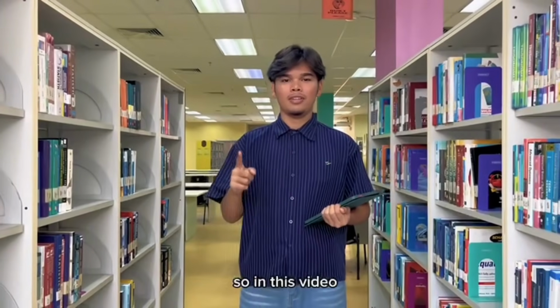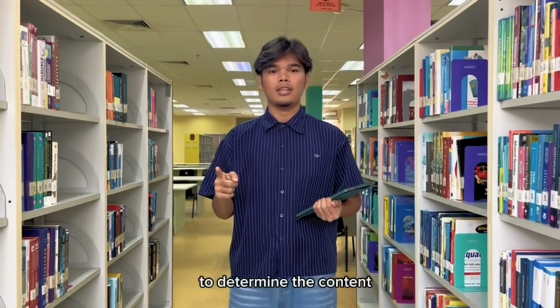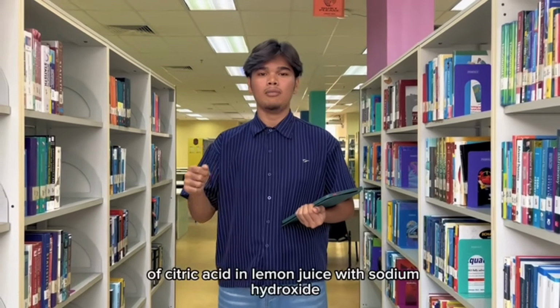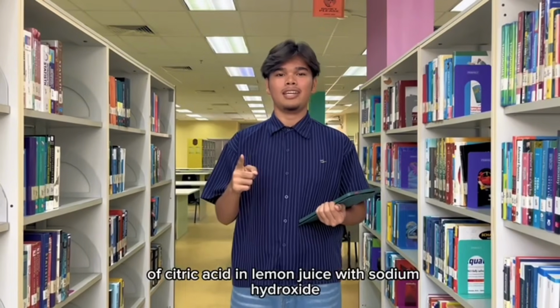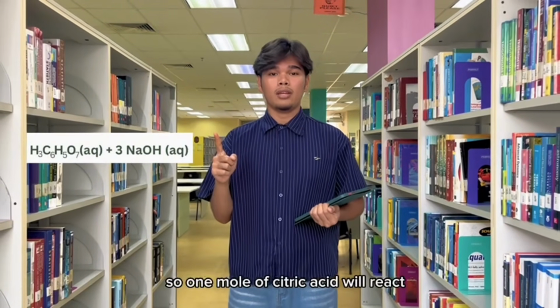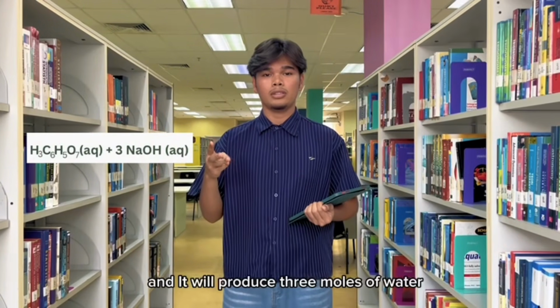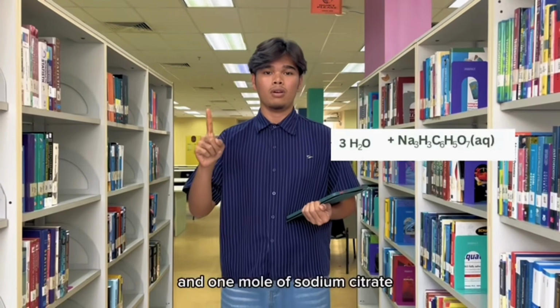So, in this video, we are going to do a titration experiment to determine the content of citric acid in lemon juice with sodium hydroxide. One mole of citric acid will react with 3 moles of sodium hydroxide and it will produce 3 moles of water and 1 mole of sodium citrate.